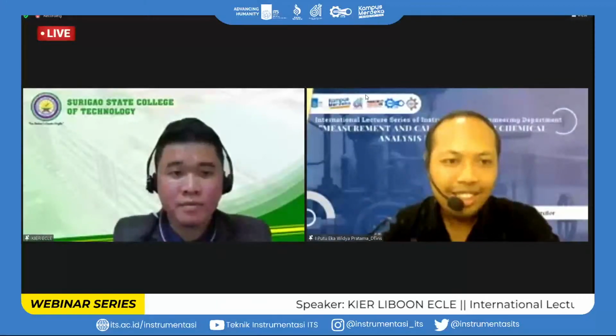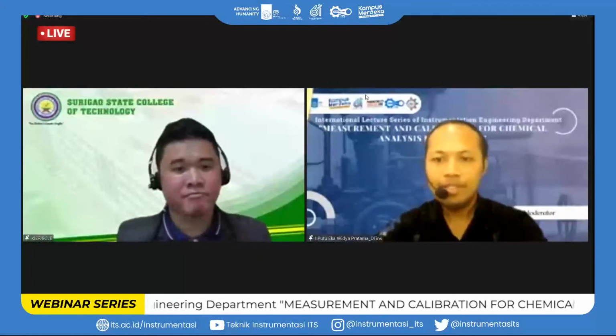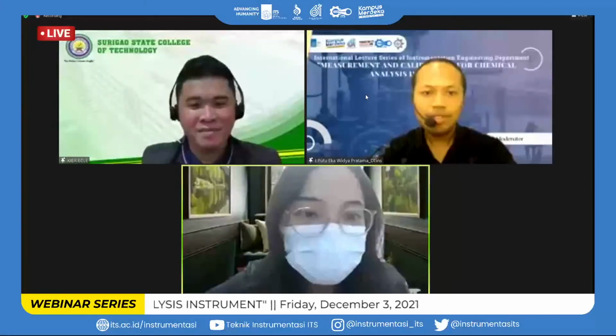Well, my question is, the hydrocarbon dew point is one of the analyzers that we use to measure the dew point of a hydrocarbon. We also use it in custody transfer.